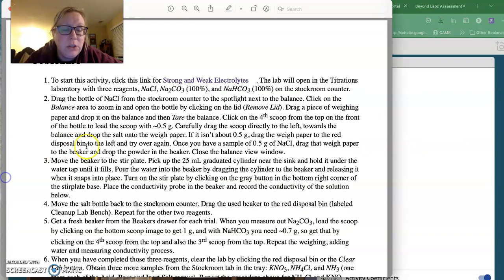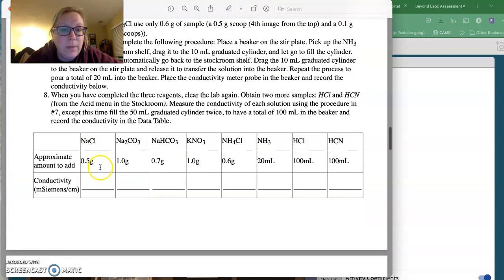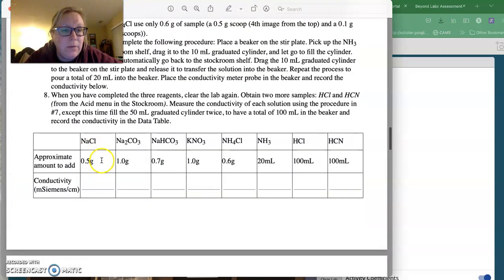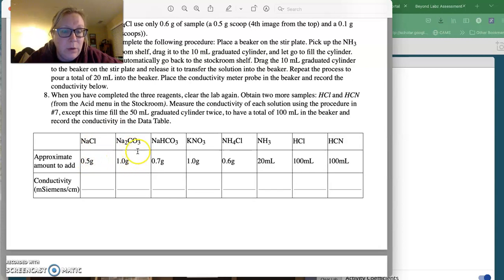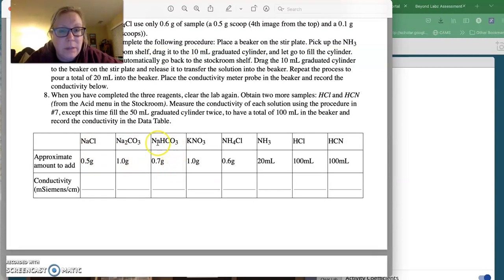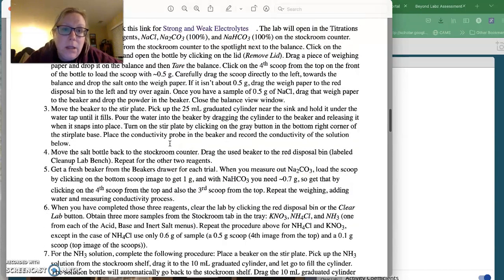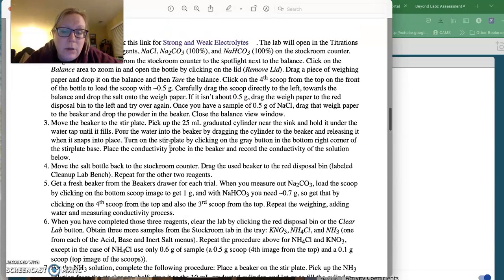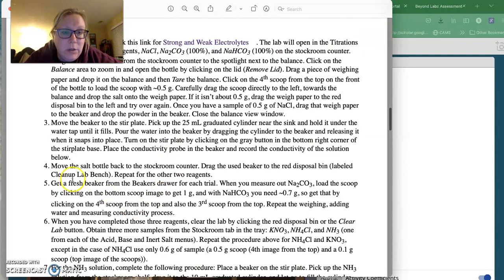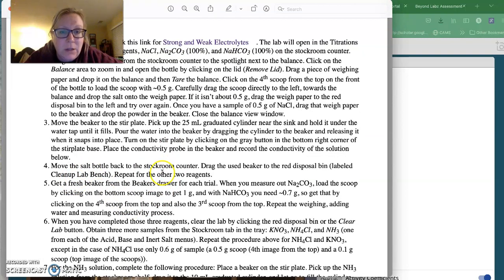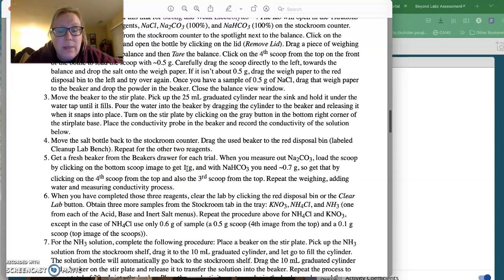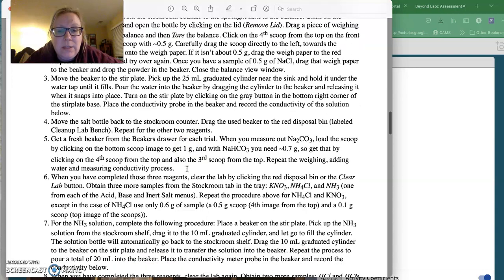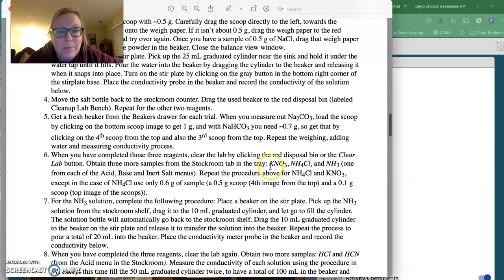What you're going to do is measure and record the conductivity of approximately 0.5 grams of sodium chloride, 1 gram of sodium carbonate, and 0.7 grams of baking soda.